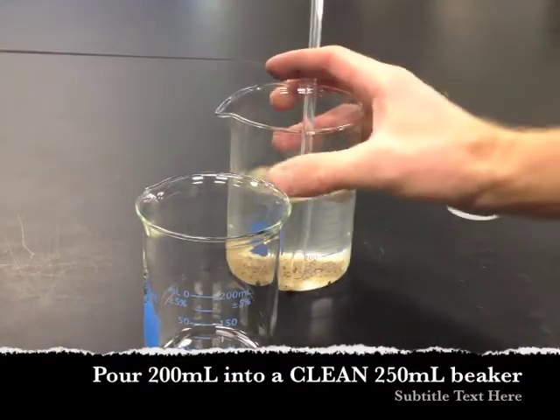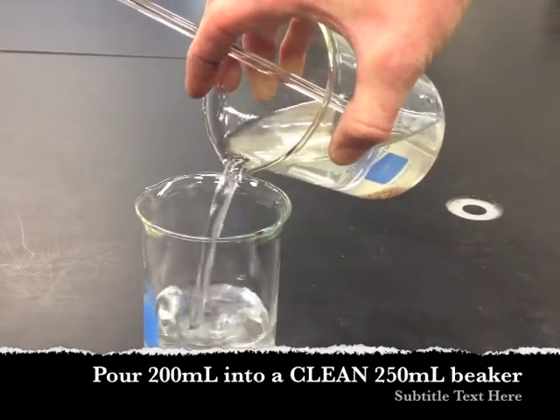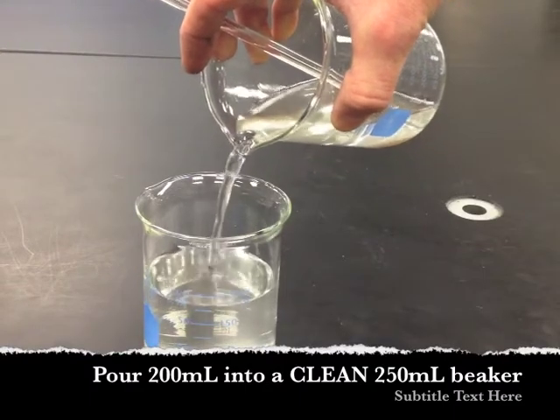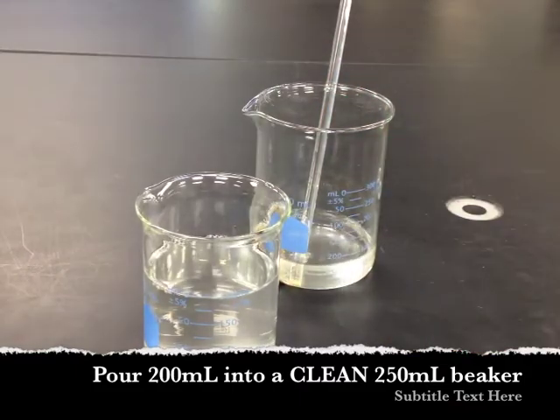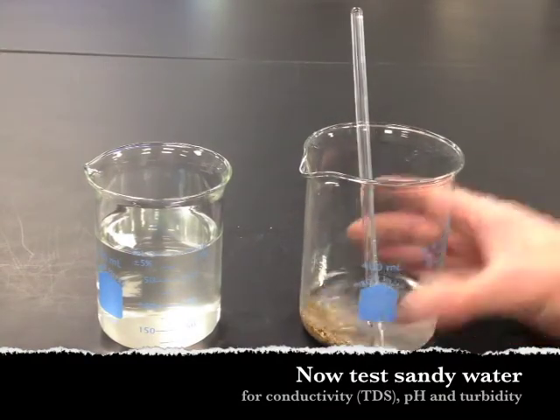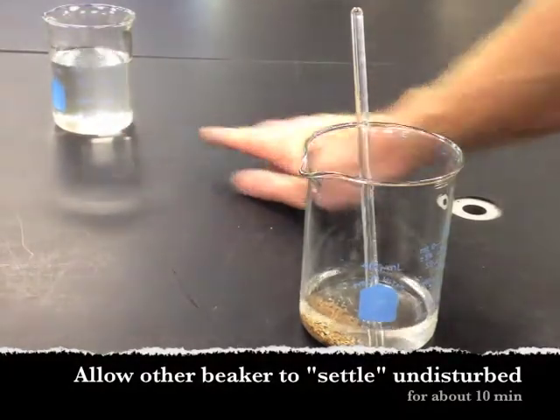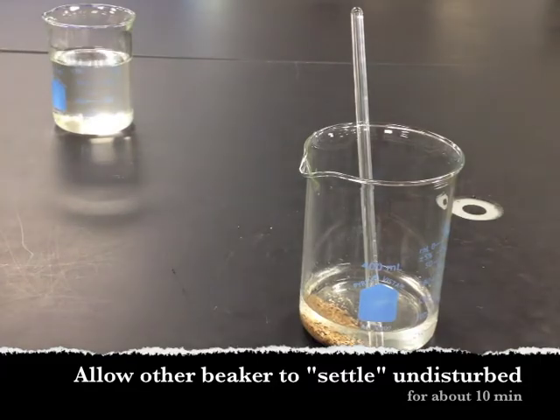After you've stirred for a minute, go ahead and pour about 200 mL of your water sample into another 250 mL beaker. We're going to do our three water tests on this, and we're going to set the original beaker off to the side and allow it to settle for 10 minutes. While it's settling, we're going to go ahead and test this water.